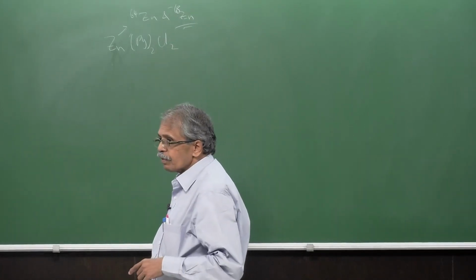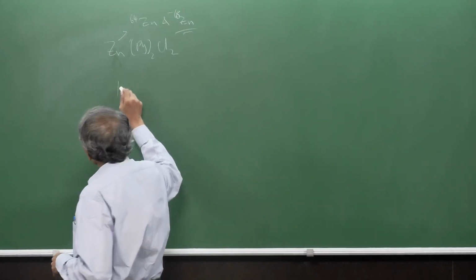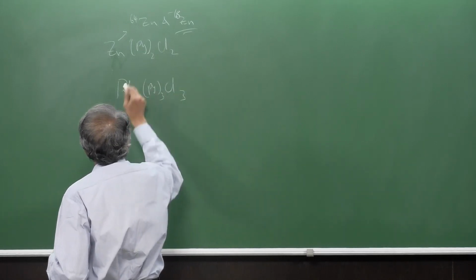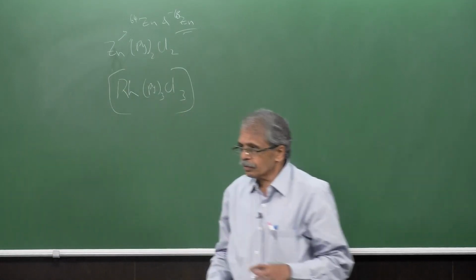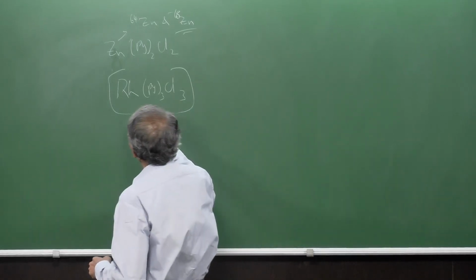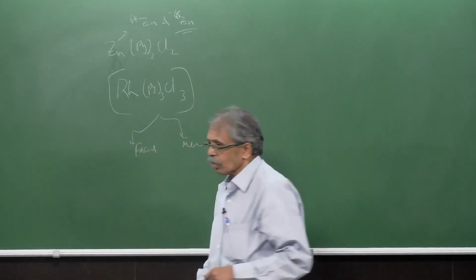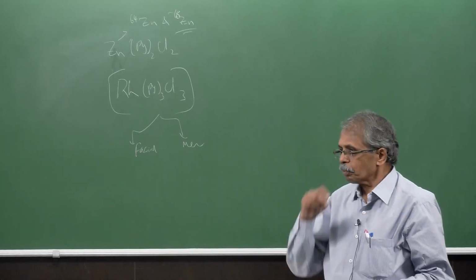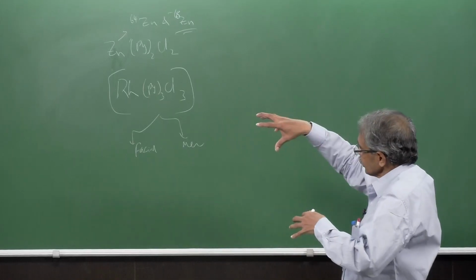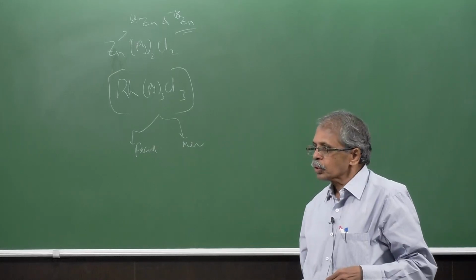Now, the left side is the infrared spectrum corresponding to rhodium pyridyl thrice Cl3. So, what do we know from coordination chemistry of this? Three are one ligand, three are the other ligands. This gives the 2 isomers, the facial isomer and the meridional isomer. The symmetries are obviously different. The facial isomer has more symmetry because of the triangular C3 arrangement, and the meridional has lower symmetry. So, what will you expect?